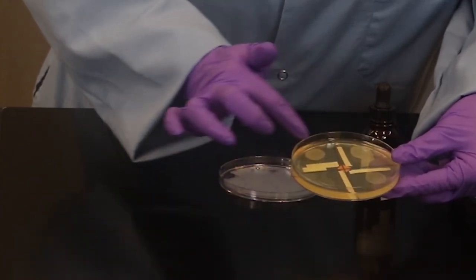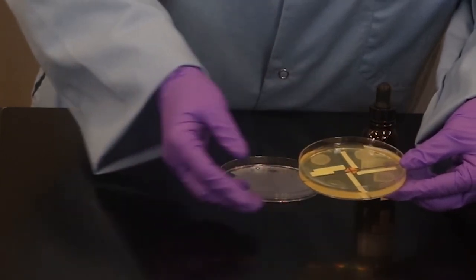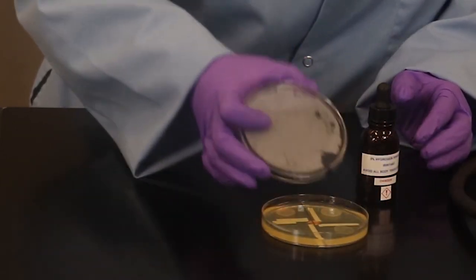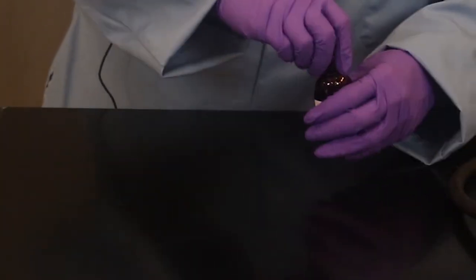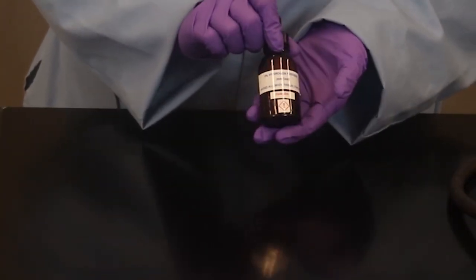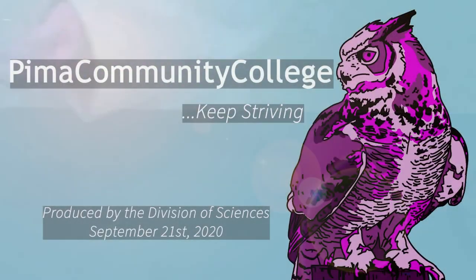I don't need to retest the other organisms unless I wanted to, unless you wanted to. But once you've tested each, you're done with the catalase test. These petri plates should be disposed in your biohazard. Make sure you've capped your hydrogen peroxide. Make sure you wash your hands when you're finished.